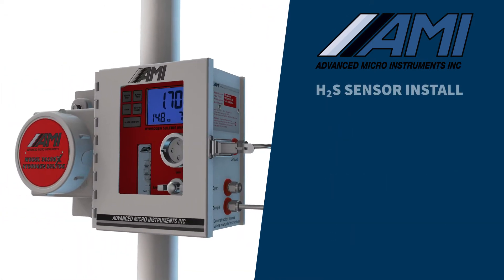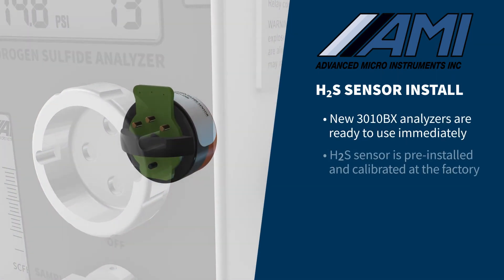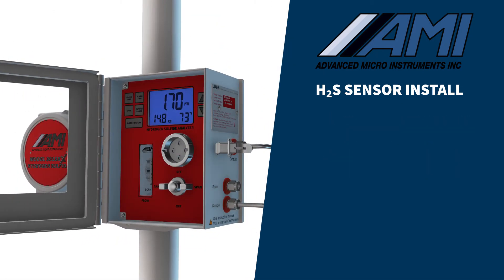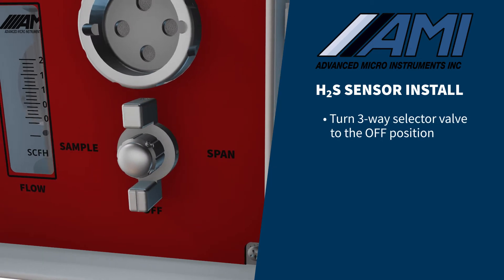Every new 3010BX coming from the AMI factory is ready for use immediately — the sensor has already been installed and calibrated. When it is time to change the sensor, follow these easy steps. First, turn the three-way selector valve to the off position.